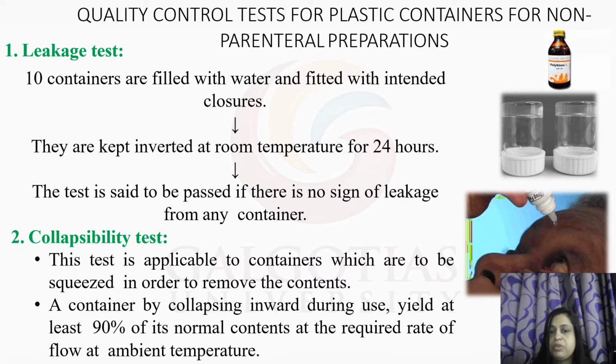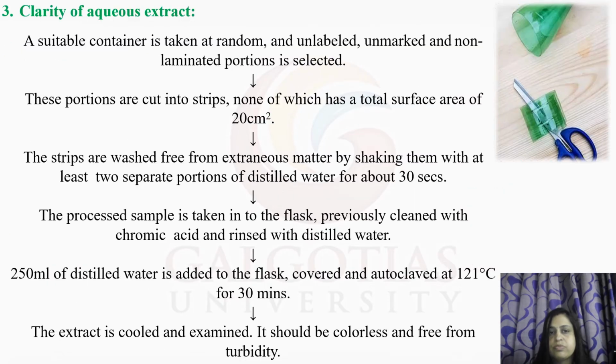This test is applicable to containers which are to be squeezed in order to remove the content. So a container, by collapsing inward during use, yields at least 90% of its normal content at the required rate of flow at ambient temperature. Then clarity of aqueous test extract.